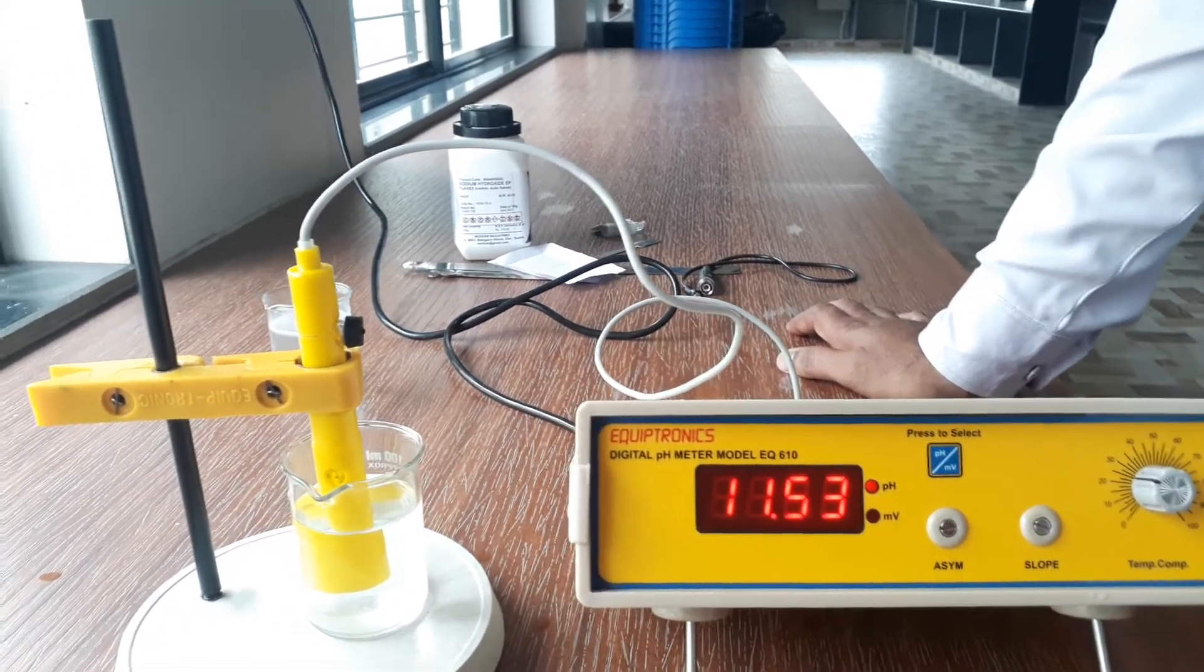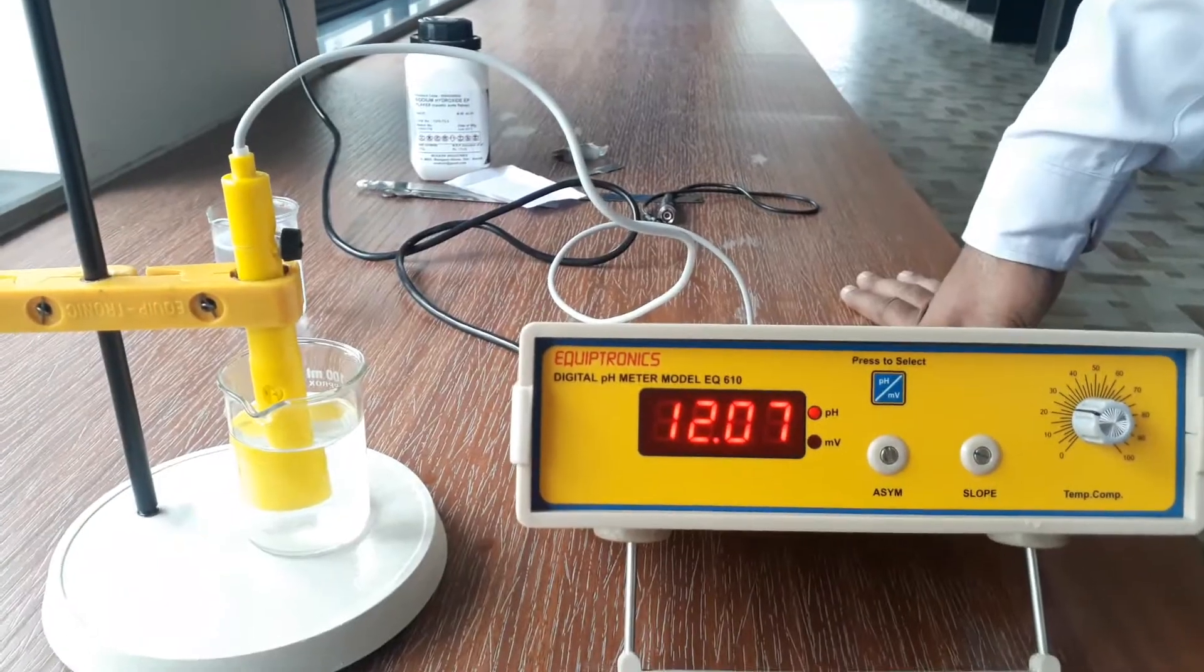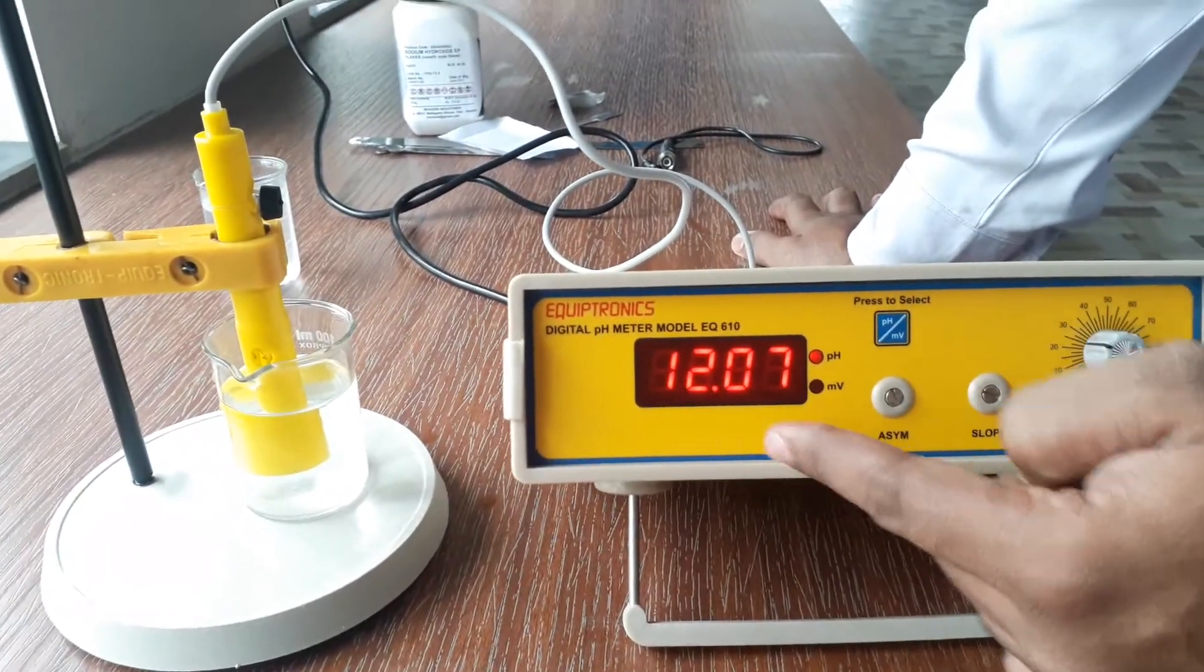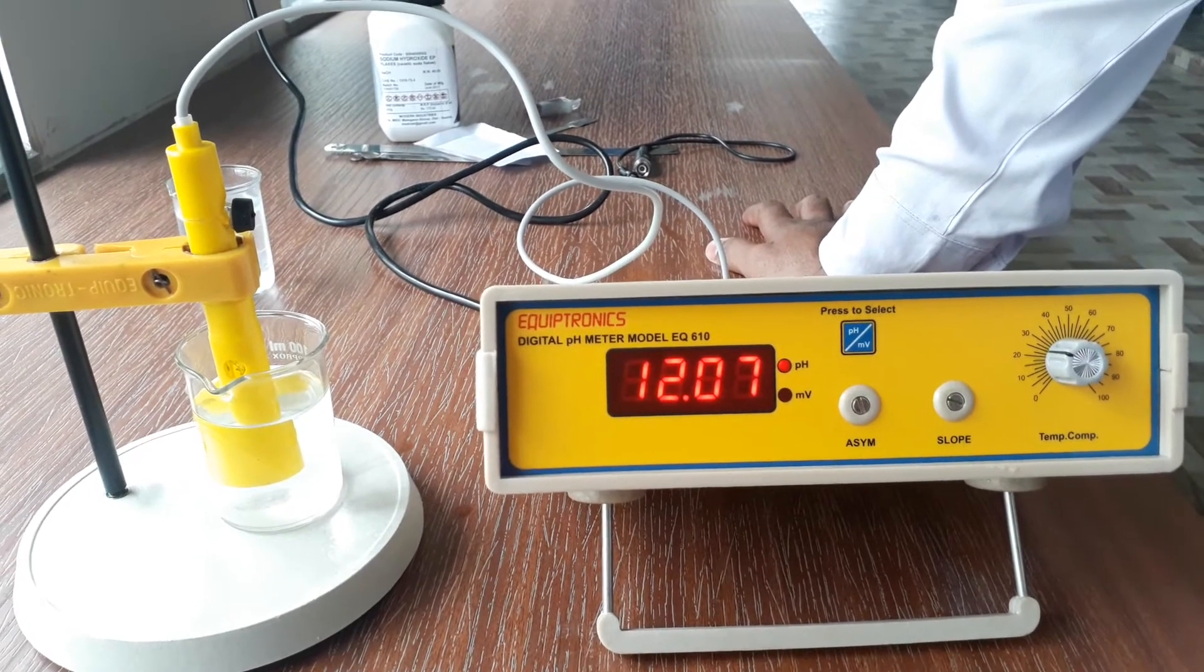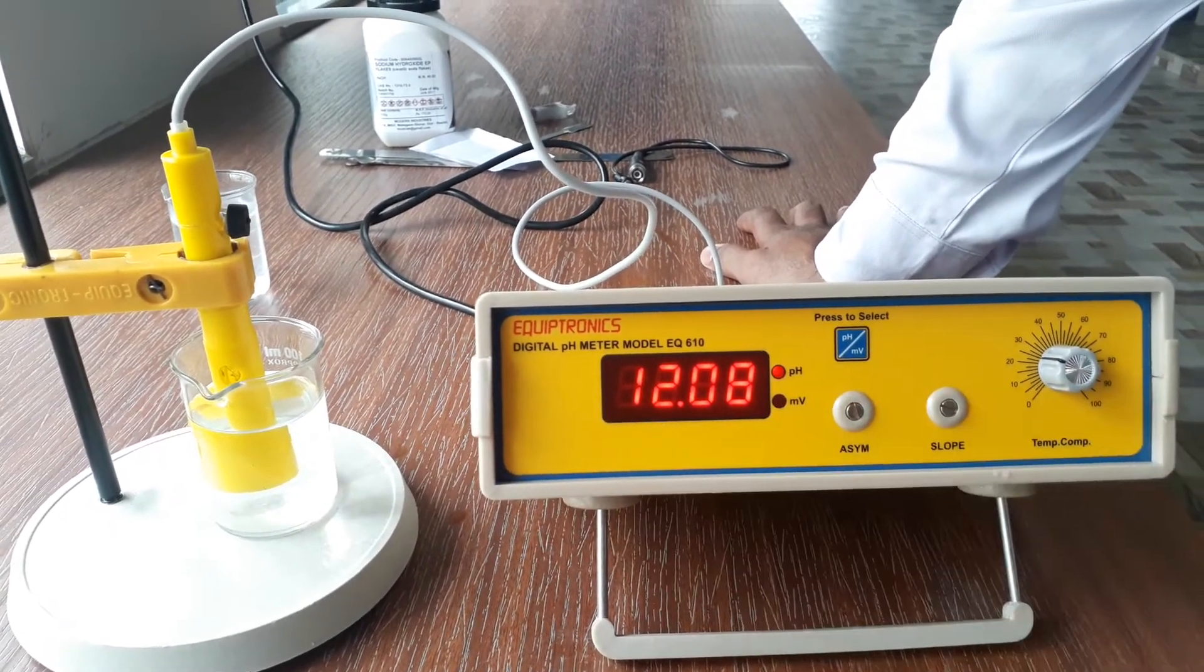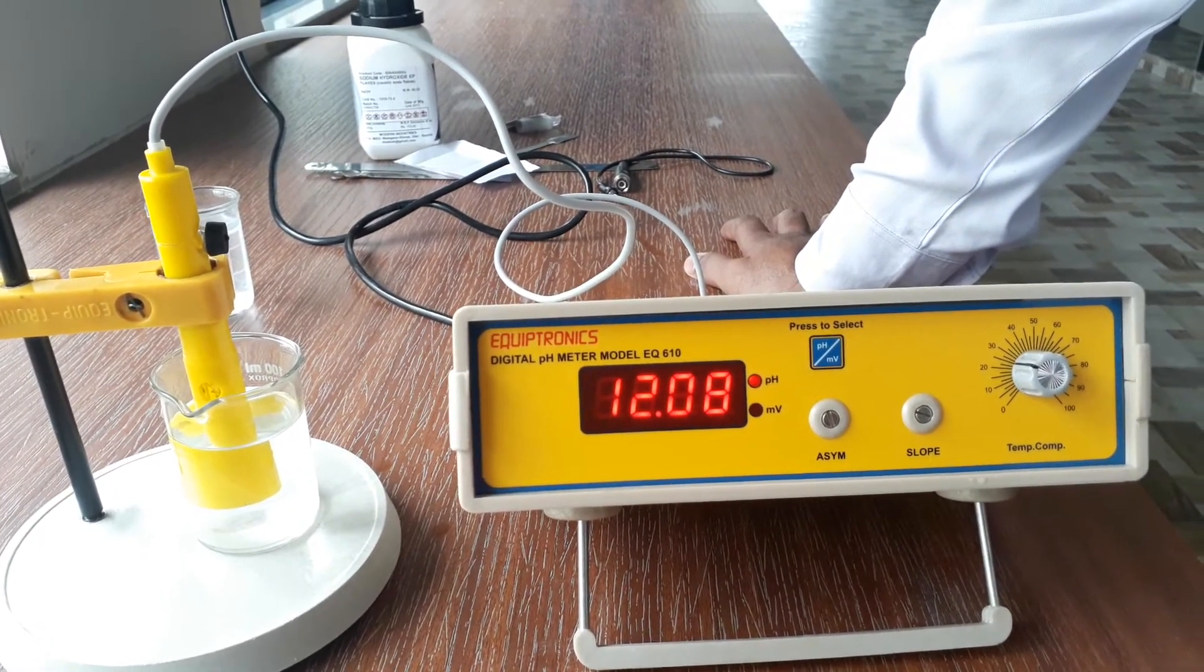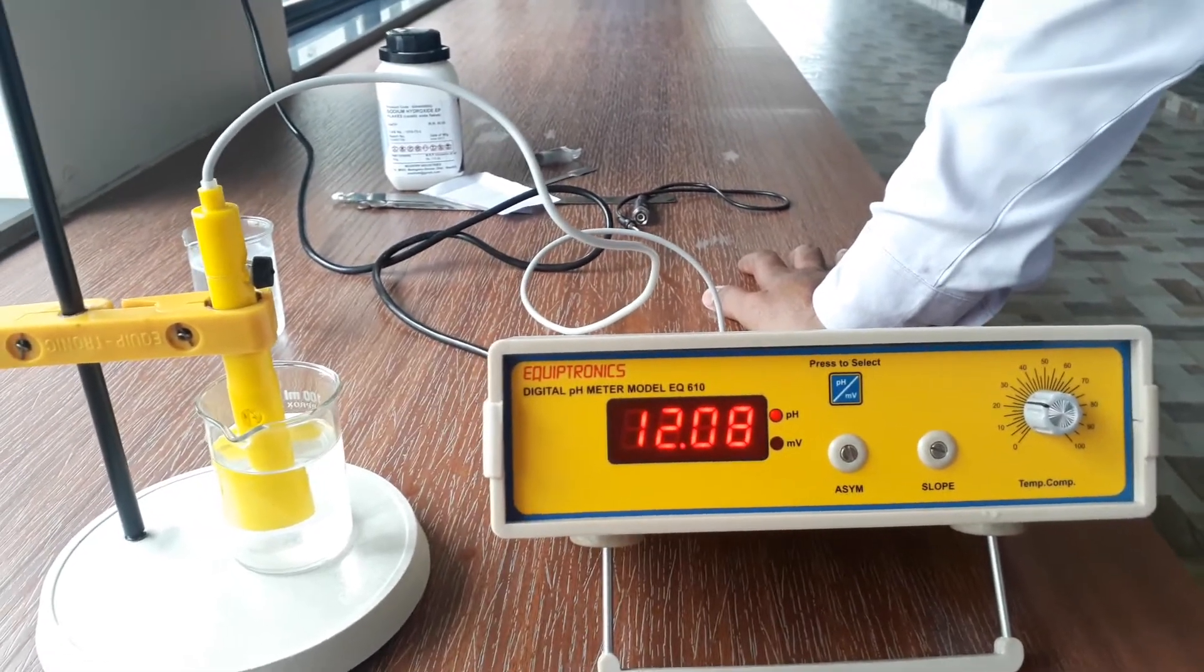We will wait for making it constant. Now you can see after some time we got a constant reading, that is 12.07. So this may be 0.1 molar NaOH or whatever. This reading shows that it is a NaOH solution because we know that the base which is showing 12 pH is nothing but NaOH. So in this way we can use pH meter for measuring exact pH values of solution.